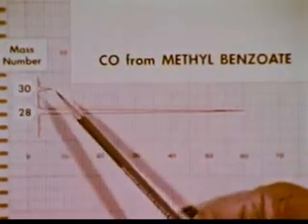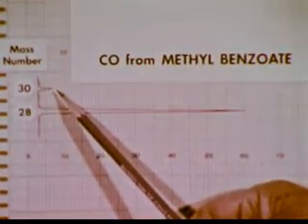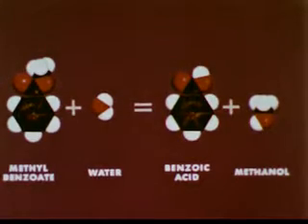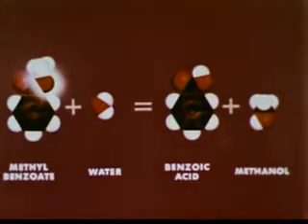The two peaks indicate the presence of oxygen 18, as with the enriched water. Therefore, we conclude that we now have an ester with labeled oxygen 18 here in the bridge. With this labeled ester, we are ready to repeat our original hydrolysis. But first, let's review the possible fate of our oxygen atom. You remember it could end up in the acid molecule.